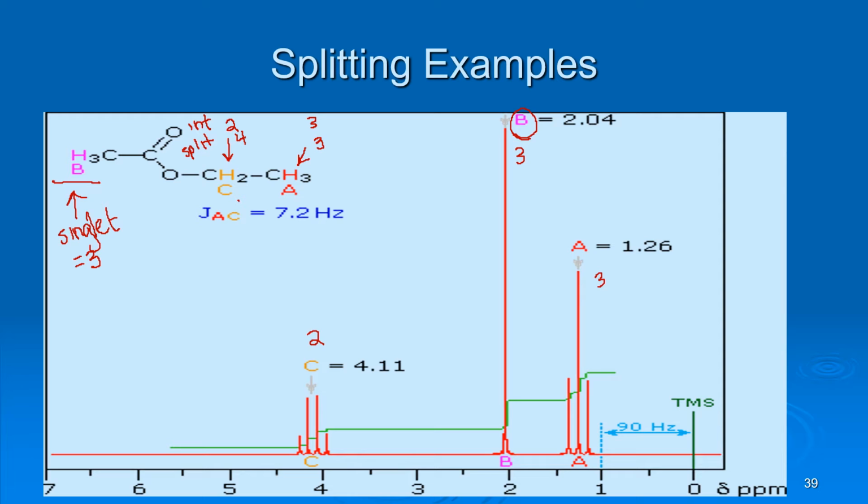Now you might not have remembered. We can look these up. And again, there's forms that I'll be giving you in lab or that are on Canvas. How would you know, is this one more de-shielding or is this one? And we talked about it, and since the carbon is directly attached to the O, it is going to be further left.